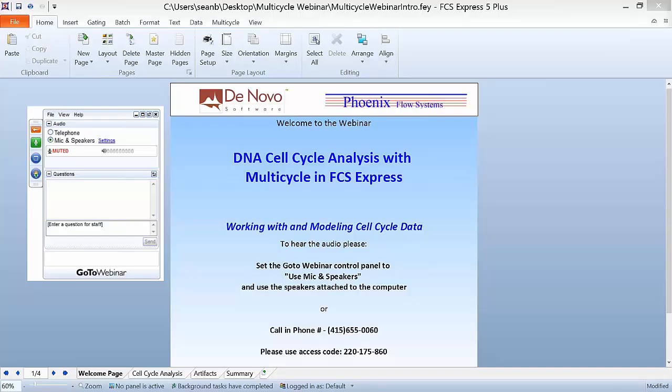Today we're going to get started by going over some of the basics of cell cycle data, some of the theory, and how to insert MultiCycle plots within FCS Express. We'll then continue on in the webinar with Kevin Becker giving us a more detailed overview of the MultiCycle platform and how all the different features and functions within that work and can apply to your cell cycle data.